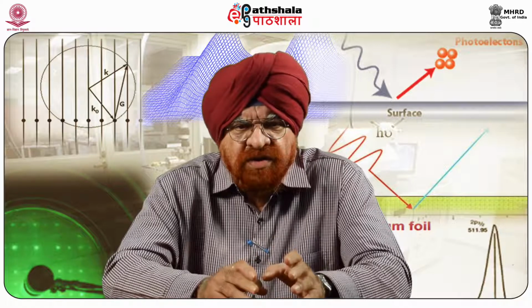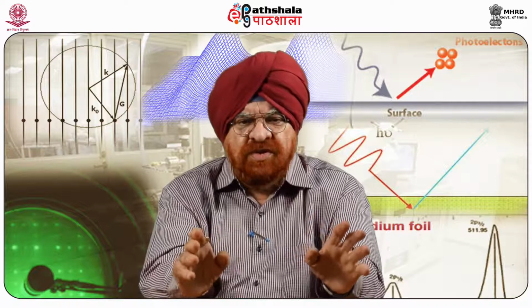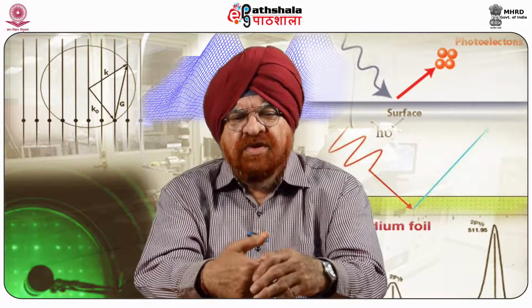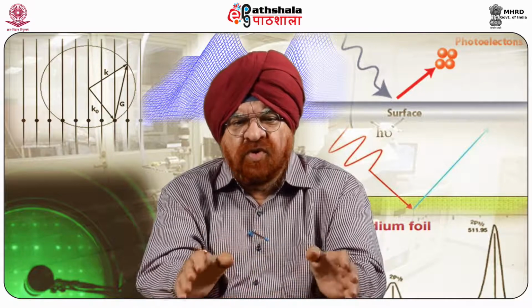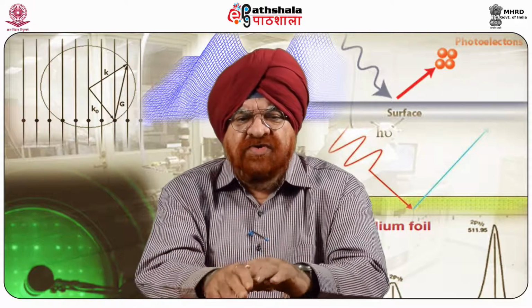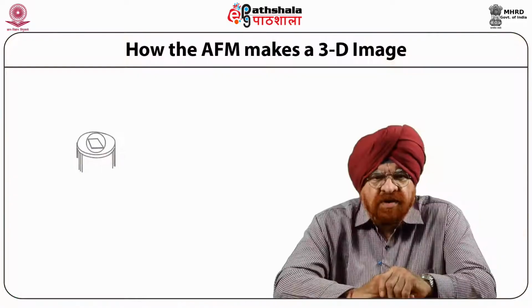We can quickly find and document the measurements and the location of interest using the built-in optical microscope with magnification up to about 2000x, that means 2000 times, can be done. For comparative studies using different probes and scanning modes, we can find this spot within 1 micron.